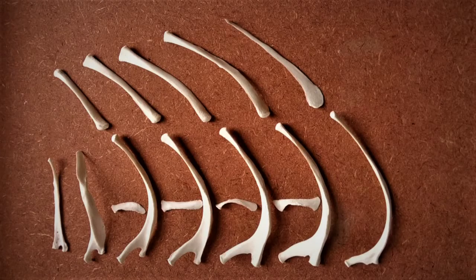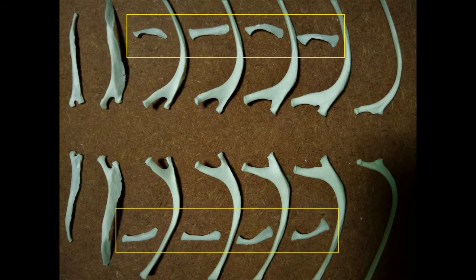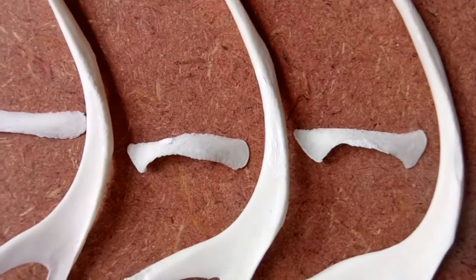Here's a close-up of the ribs. These are the four pairs of uncinate processes that lie between the second to the sixth ribs. And here's a close-up of the uncinate processes.